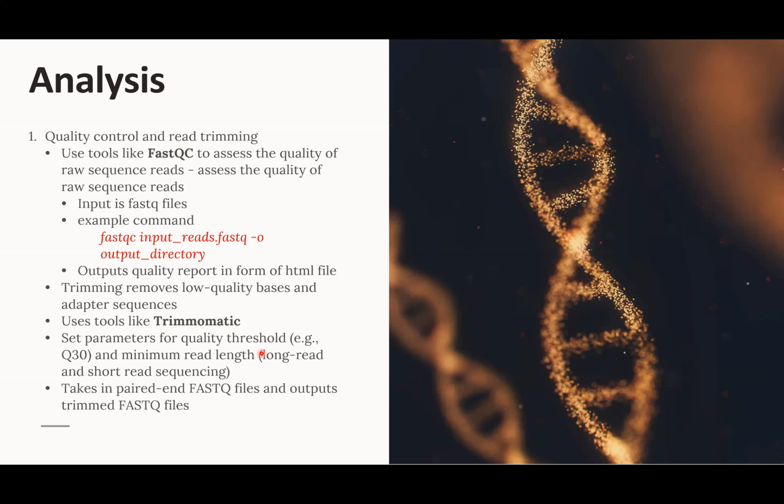And then you can set the minimum read length to trim. So depending on the sequencing method you used, which are usually long read and short read sequencing, you can decide the minimum read length. So if you used long read sequencing, then you will definitely have to have a longer read length than if you used short read sequencing.